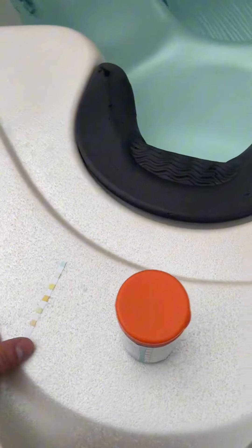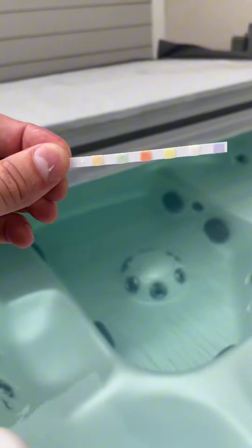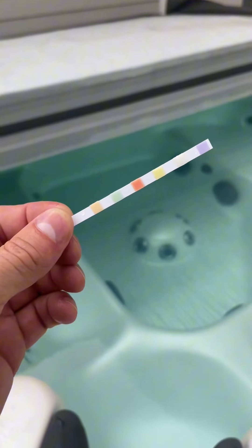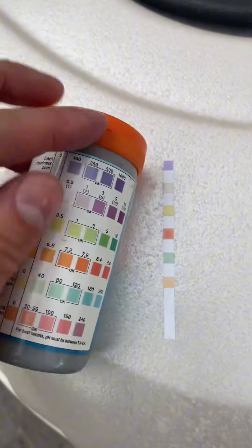Here's how you use it: you're going to put the strip in the water for about two seconds, give it a little wiggle, then hold it nice and horizontal for about 15 seconds. The reason that's important is you want the water to interact with all the chemicals in each of the little tabs on the strip. After 15 seconds, shake it off and then put it down to color coordinate.